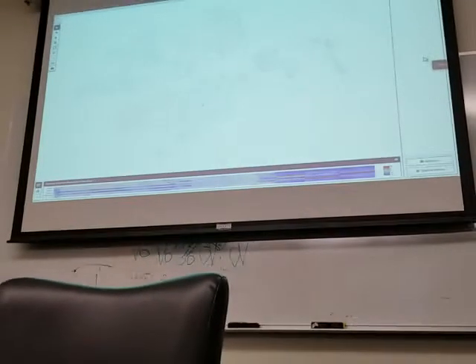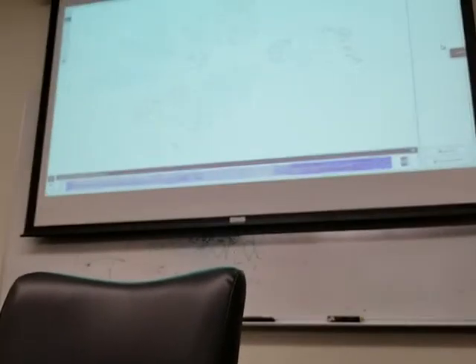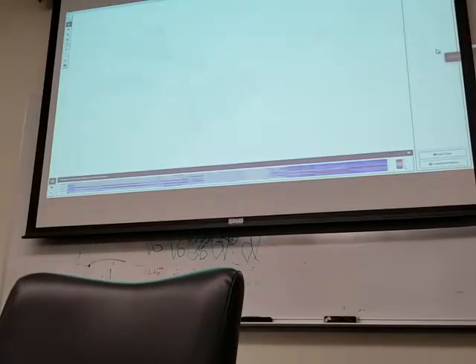The one thing, though, is we're still seeing quite a bit of separation here. So that's 166, whereas these ones are all 165. That's quite interesting. It can imply a little bit of batching effects.